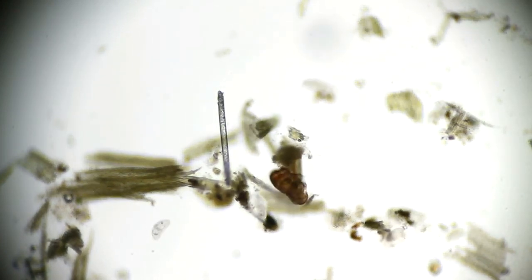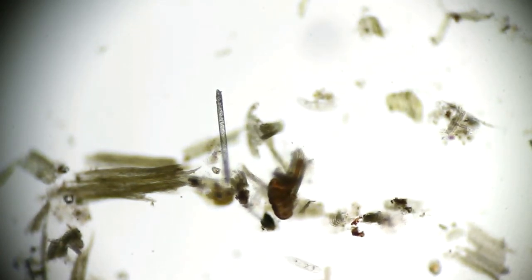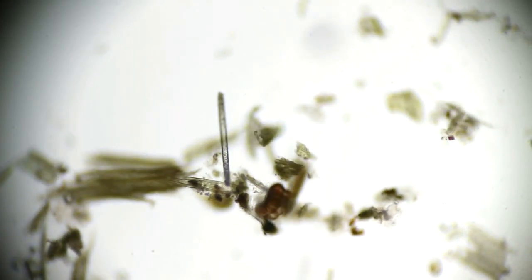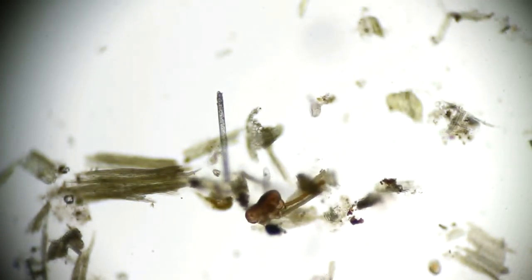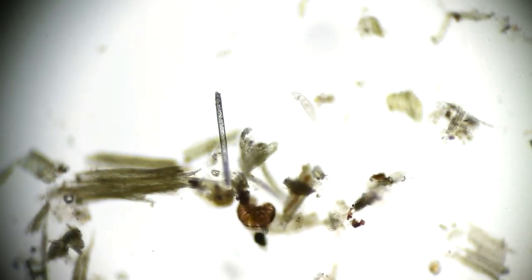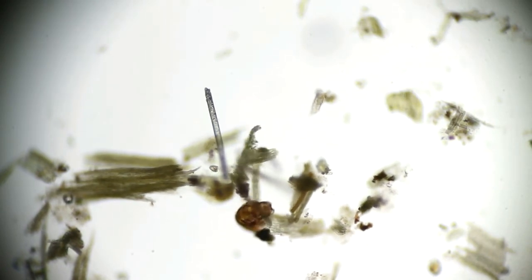First of all, trying to keep these guys in focus while they're moving, when all I can see on the back of my camera is a small screen, is really difficult. Plus, they're quite chunky organisms, and basically, as they move through the depth of field, part of them is always out of focus unless you extract frames and focus stack them.